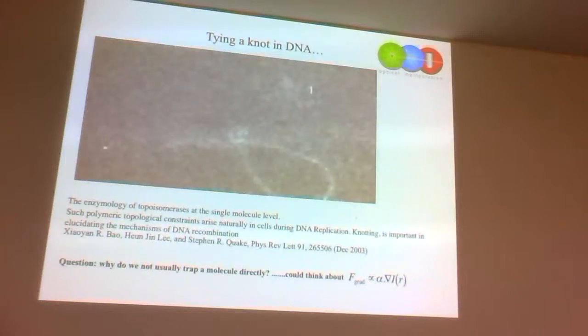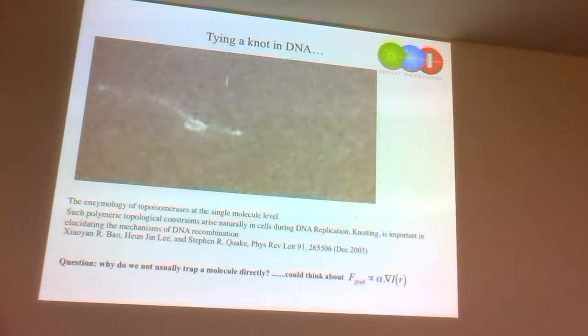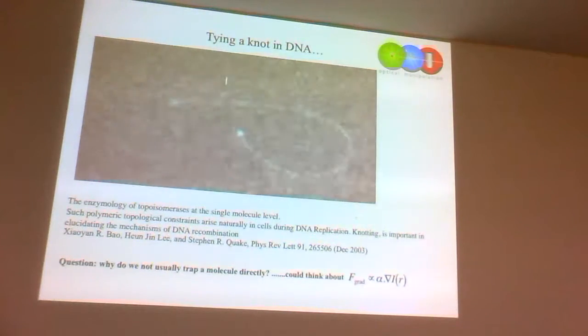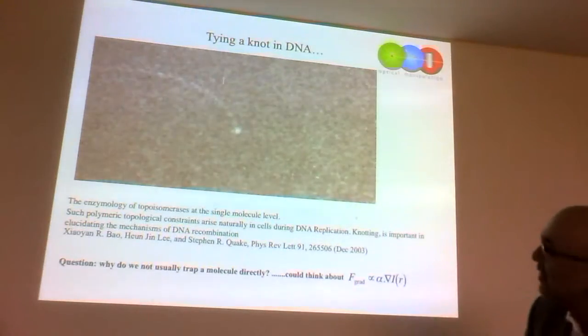It's a combined fluorescence plus optical tweezing setup. So it'll be optical trapping in the near infrared, probably at 1070 nanometers, with a dual beam trap, so two traps, and they are using biotin-streptavidin between them, and then probably a sequential fluorescence imaging scheme. Those are the media details that are probably relevant in that paper. Okay?